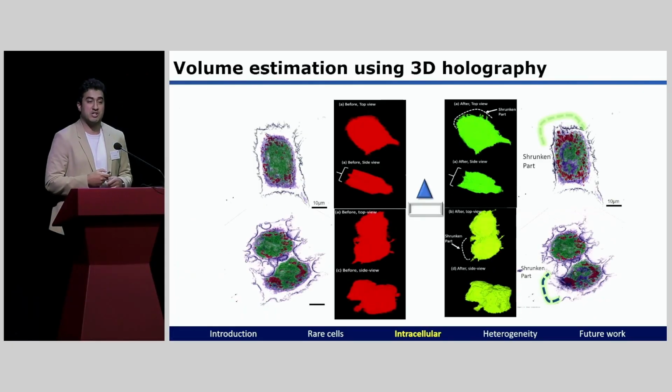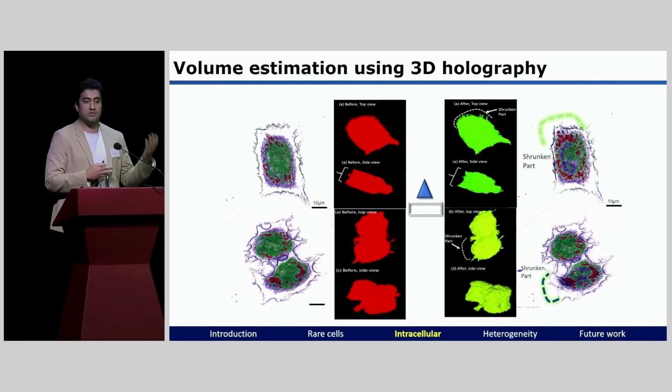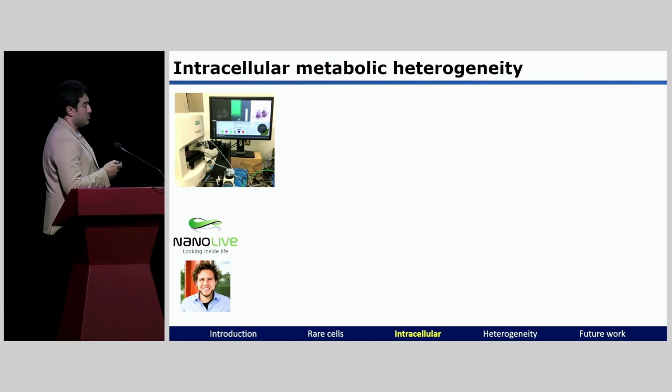So we took another 3D image after. Now, because all of this is digitally stained, the cytoplasm is stained, we can just subtract the images from each other, and that gives us quantitative data about the cell volume. Once you have the volume of the sample that you're measuring, it's relatively easy to then use mass spec and do calibration lines, et cetera, and you quantitate. We did this twice with them. We also visited them back in Switzerland, and we drilled holes into their precious microscope to put our sampling setup on it.